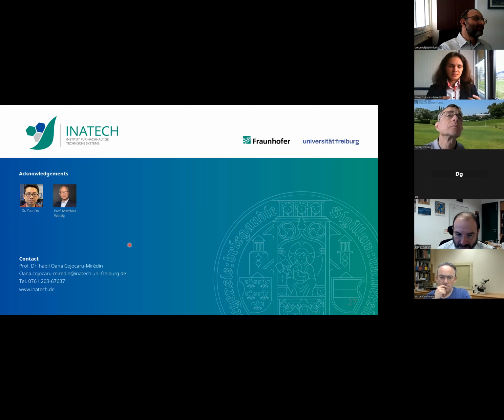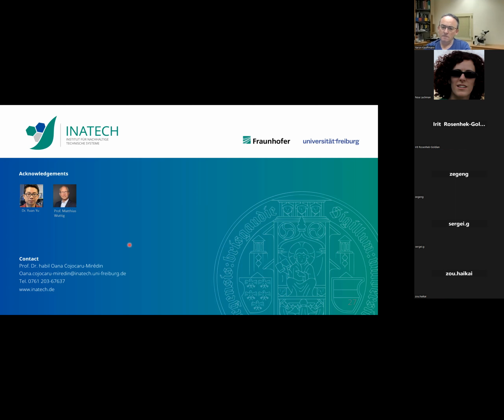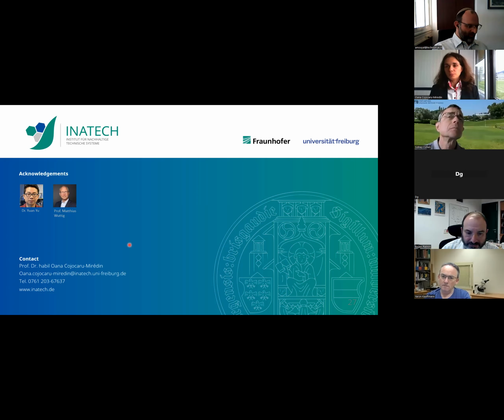So we typically use the TEM to check the quality and the crystallinity of our atom probe tips, and also with the atom probe, you can check if you have gallium implantation inside the tip and how this can be reduced. So there is a really huge field. And I think this is the same with the TEM lamellas, of how to strongly reduce the contamination on the tip and to preserve the initial structure of our material and the initial composition.